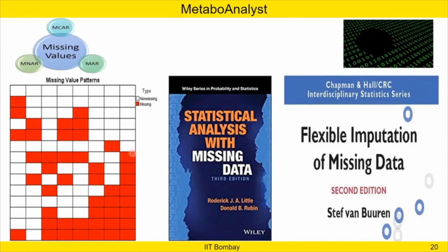signal ratio, right? This is a very important thing: in the mass spec or in the MS analyzer, we need to put a threshold. That is an intensity threshold that doesn't allow a particular intensity, if it is less than that, to be presented as an intensity. So this is something which is detected as noise, right? So this is a very important part.